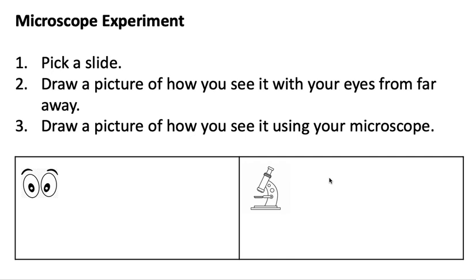So hand lens helped you see really close and see all the small things bigger. Now we're going to look at the microscope. So you need a slide, which is something that you put under the microscope. You need a microscope and you need a pencil. Go ahead and pause and then click play when you are ready.